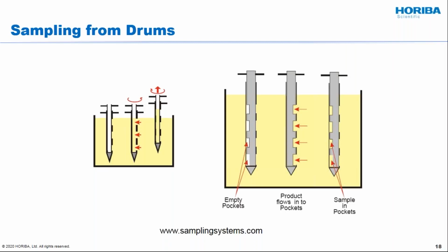And you do this until the entire vessel is full. You then combine all of those individual samples, and that is the composite of what's in that entire container. But in the real world, very often you don't have the option to go back to the process, grab the particles, and do things with it. So this is the next best way to do it.